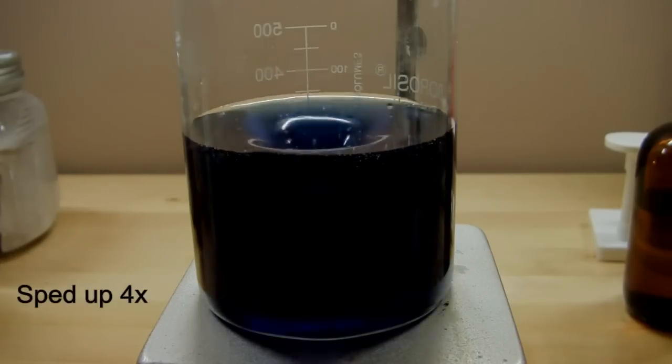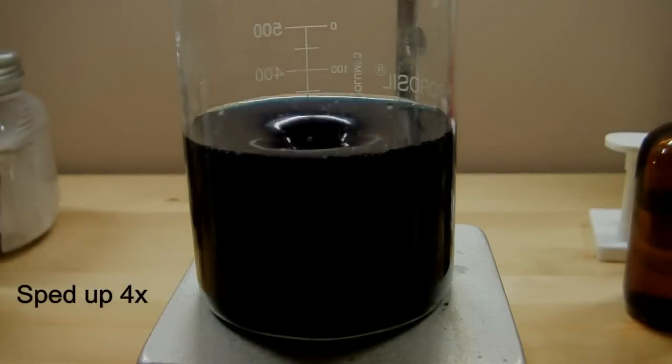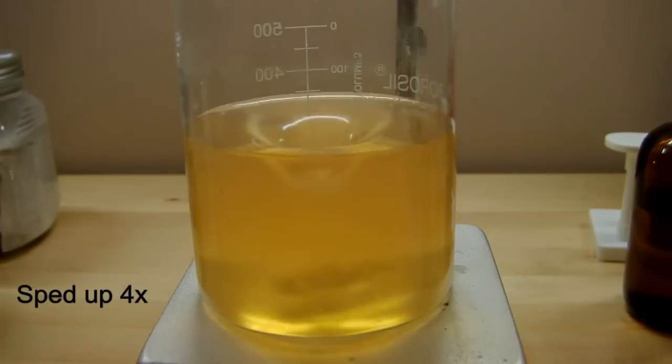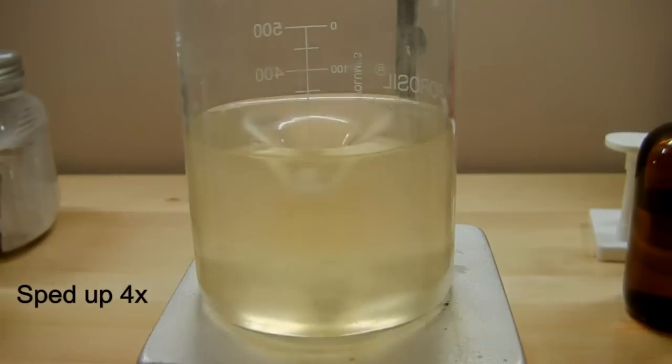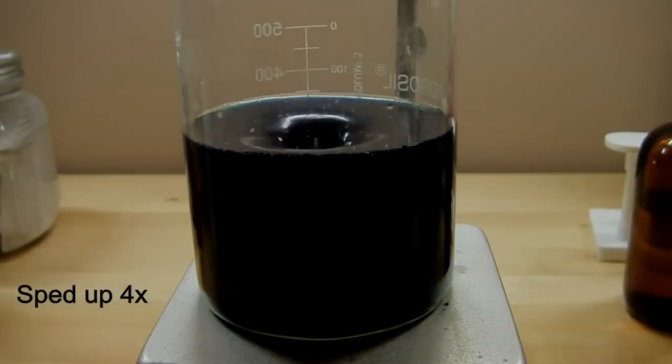Like I said the reaction is extremely complex but I'll try to sum it up for you. Basically there's two separate groups of reactions, a fast radical process and a slow non-radical process. Both of these processes reduce iodate to hypoiodous acid, HOI, with the radical process doing so at a much faster rate than the non-radical process.